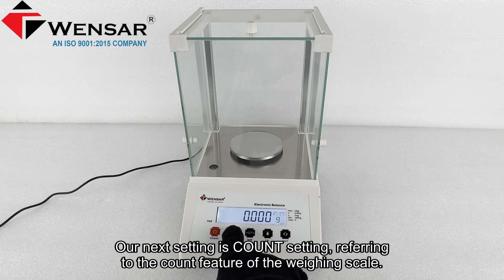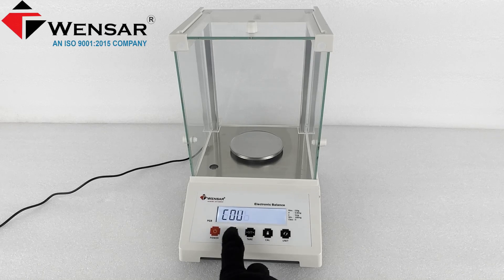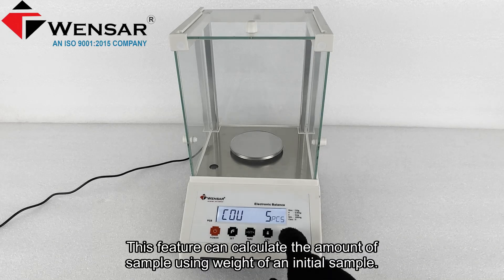Our next setting is the count setting, referring to the count feature of the weighing scale. This feature can calculate the amount of sample using the weight of an initial sample.